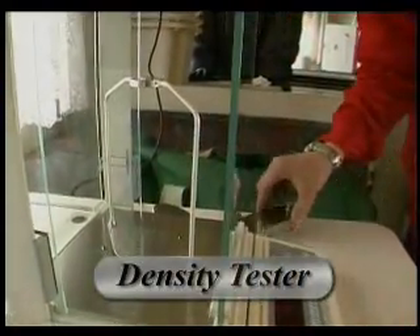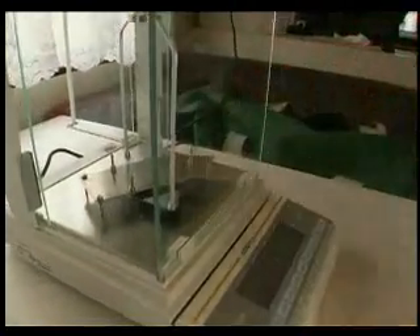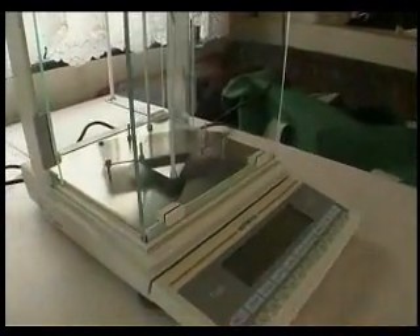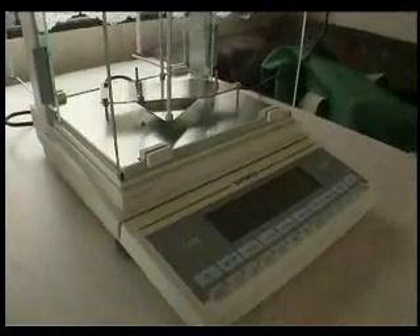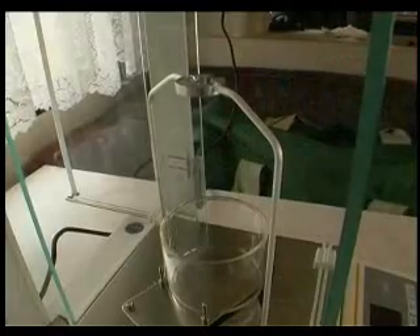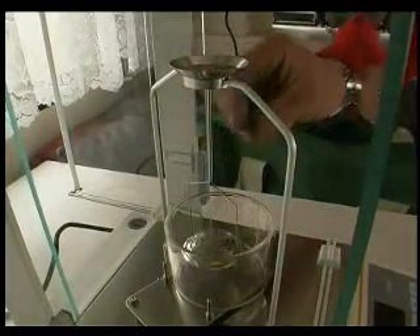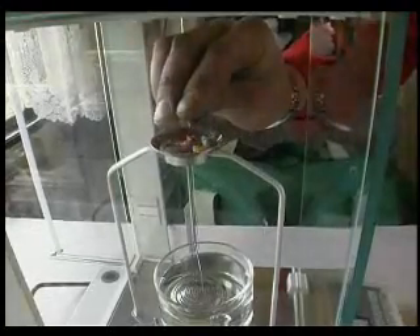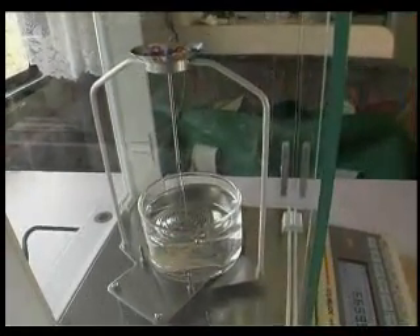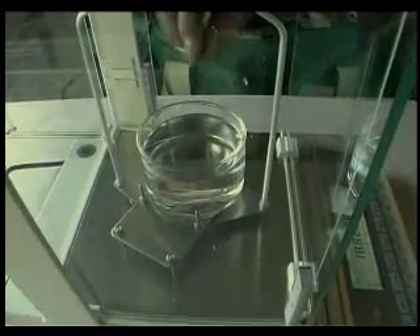The analytical scale can be turned into a density tester by adding a supplementary attachment. Two measurements are compared for the density measurement: the sample is weighed firstly with air, and then it is weighed in methanol.